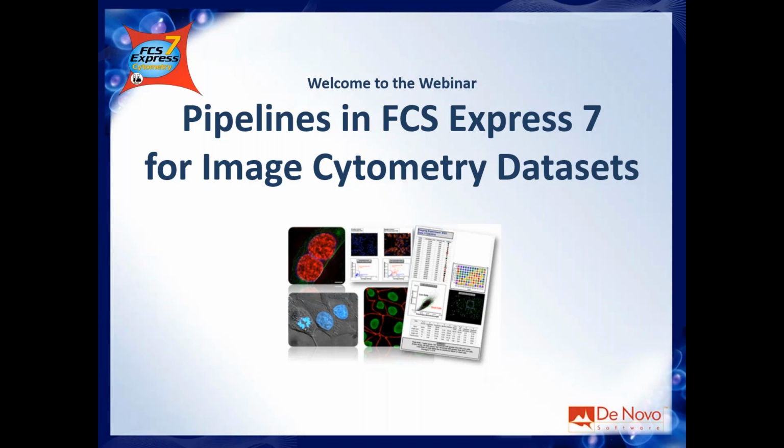I have a few slides of introduction. Today we will speak about image cytometry data, FCS Express 7, and you will see what I mean with pipelines, which is a really cool and very new tool that we developed. It took us almost 1 year to develop it, but it's really great. It's like a game changer.